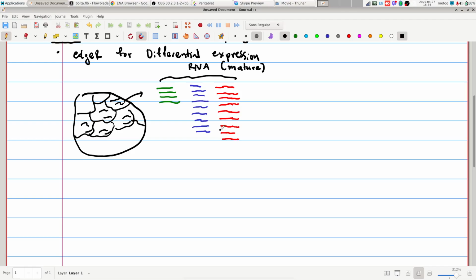So what we do next is that again we proceed with, we fragment these RNAs, and then we choose the fragments of the right size. So here we have fragmentation. Size selection. As we do with all NGS experiments. And then we proceed with sequencing.